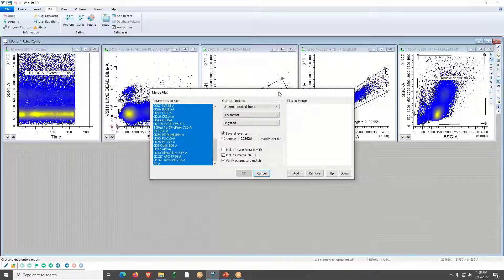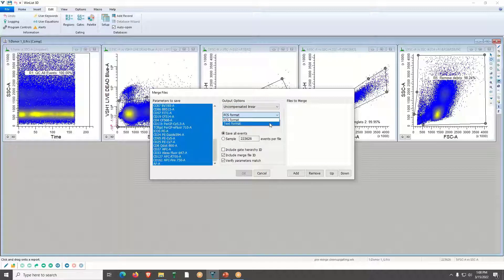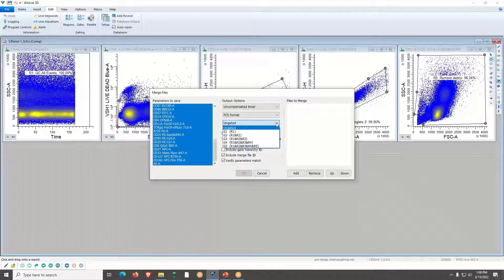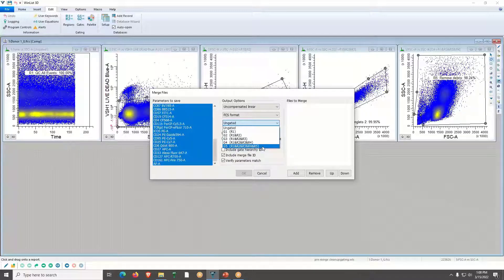We generally save all parameters to make things a bit easier. For Output Options, we use Uncompensated Linear in FCS format, though Text format is also available. If you have a gating scheme set up, WinList will recognize it and allow you to choose which one to use — I'm going to choose G5, which is the cleanup gate.